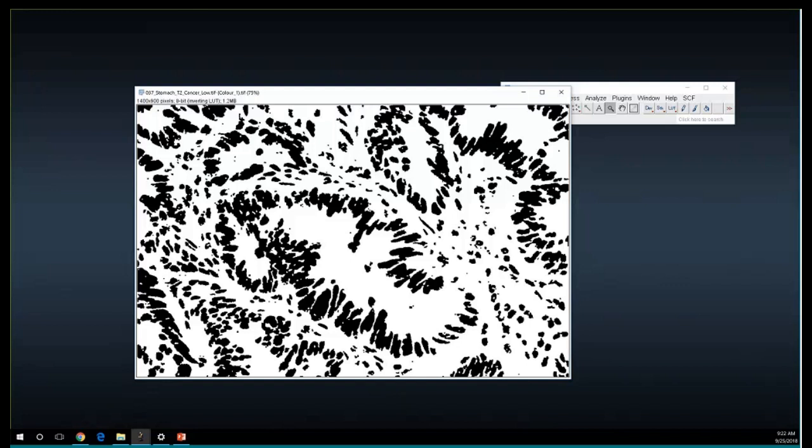But for now, let's say you reach this step, you're satisfied with your segmentation, and the nuclei look clean to you. Now you're ready to segment these cells from each other, where the next step is to separate the touching cells from each other.